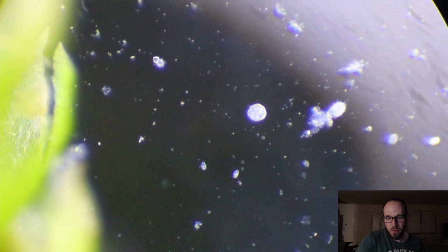And this microscope was such a good deal, too. Like, for the quality you get, it was not even, like... Alright, shipped, it was like $350, I think. But the dark field filters, I also have color filters that I haven't really been using too much.